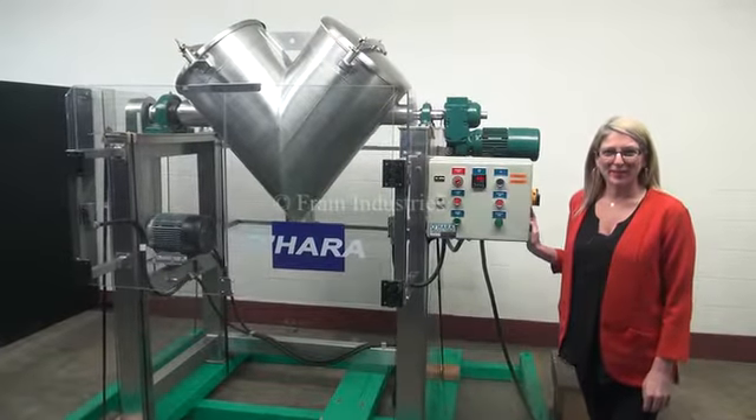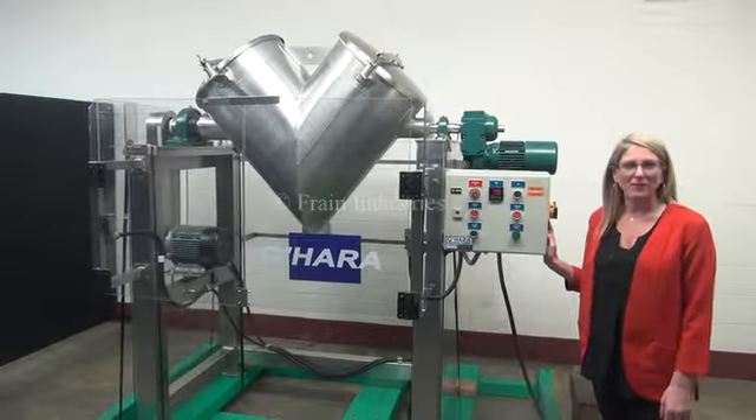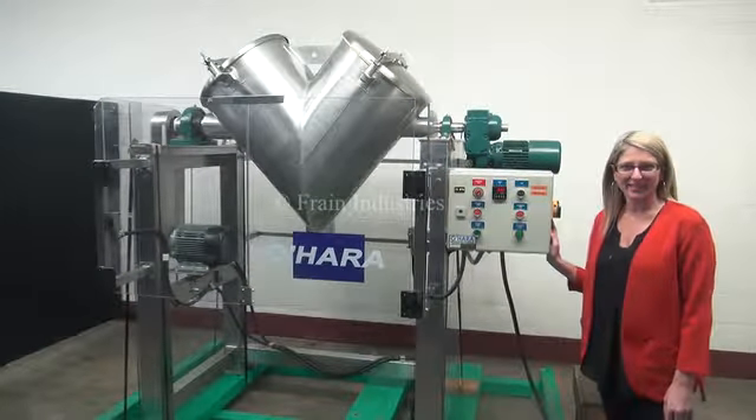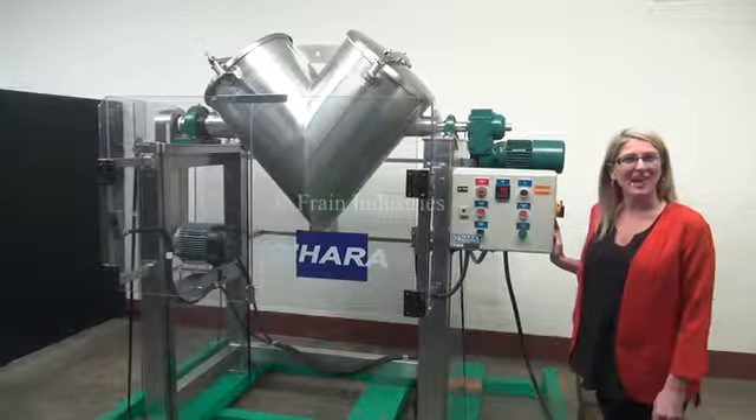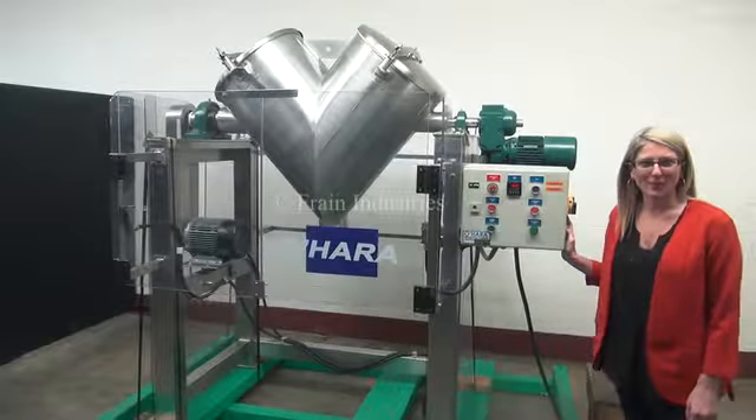Hi, I'm Katie with the Frain Group. Today we're cycling your O'Hara 5 cubic foot twin shell V blender. We recommend you read the manual in its entirety before powering up the machine. The voltage is currently set to three phase 240 volts.